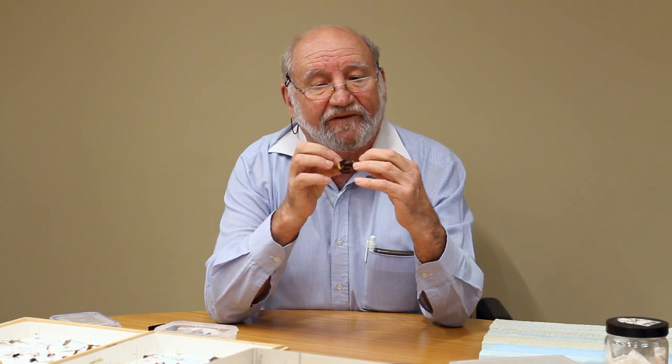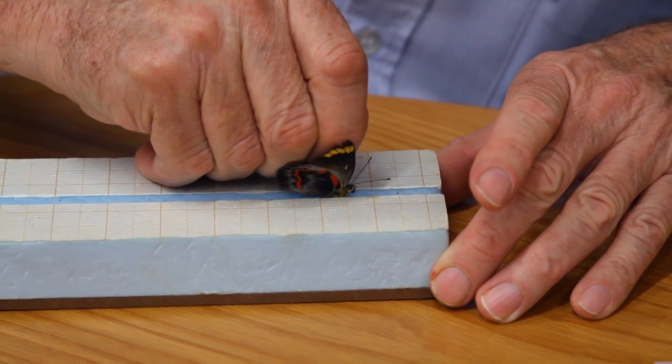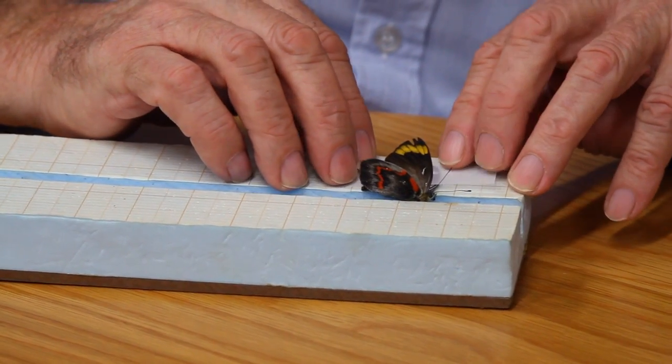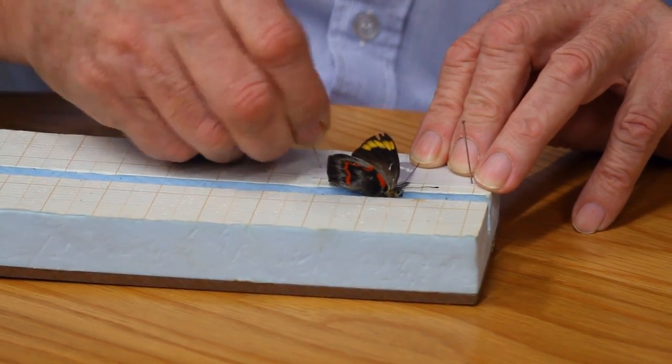The next step is to separate the wings if you can — this sometimes is difficult. What I normally do is get the pin top and press it into the pinning board. Take a piece of tracing paper — these are little strips that have already been cut — and place it on the wings of the butterfly. Put in a couple of pins to hold the wings down, and do the same on the other side.